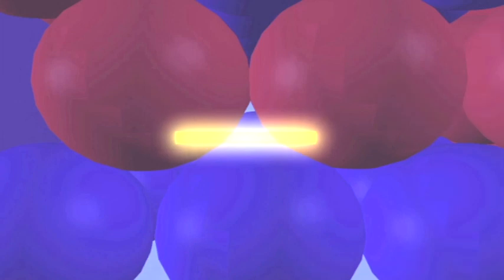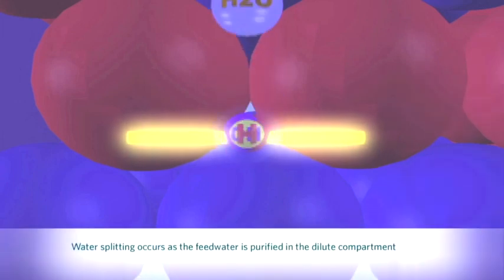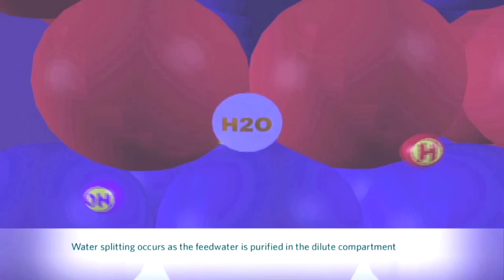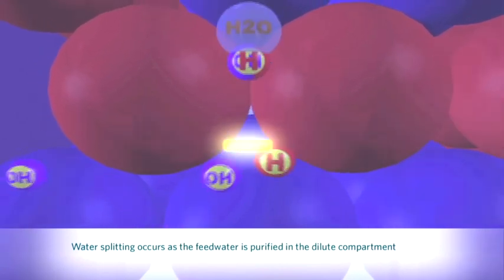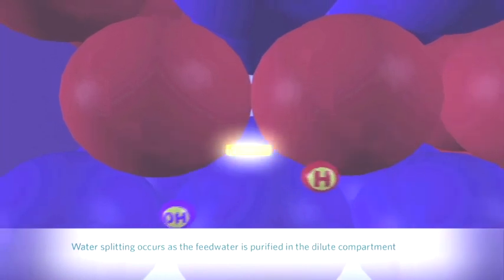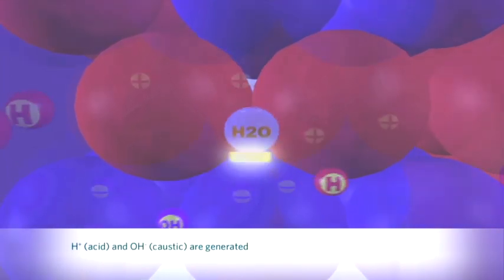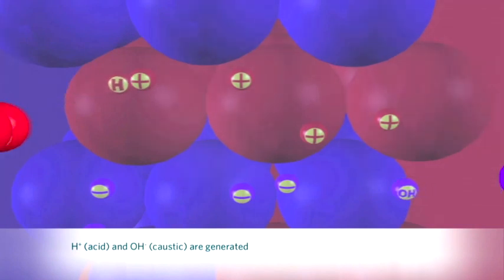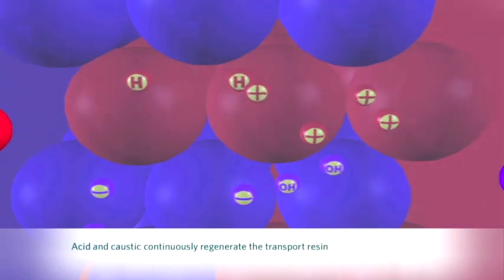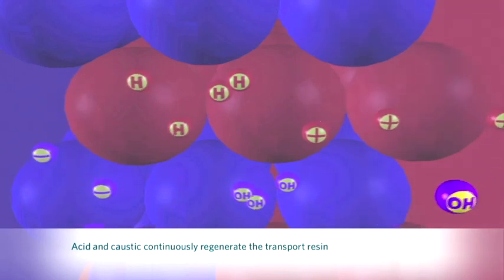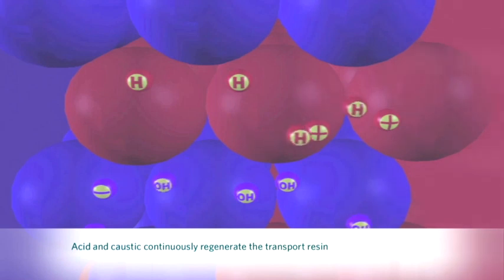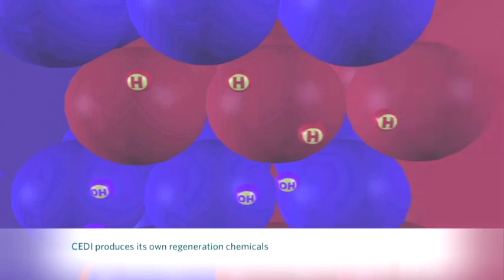the electric field becomes concentrated between the resin beads and the surrounding water. When this localized voltage potential exceeds approximately eight-tenths of a volt, an electrochemical reaction occurs and water molecules are split into hydrogen and hydroxide ions, which are essentially acid and caustic. The acid and caustic generated in the module regenerate the resin beads by replacing other trace ions remaining. The attachment of hydrogen and hydroxide ions to the resin beads is exactly what happens to resin beads when acid and caustic are used for regeneration in conventional deionization systems.